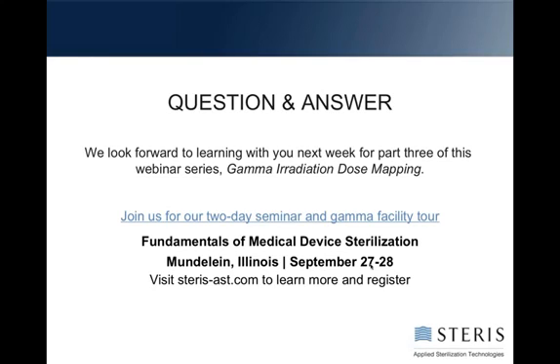All right, next question. What would be the best course of action if the quarterly bioburden for VD max 25 exceeds 1,000 CFUs? The question would be first, is it one sample or is it a whole bunch of samples? If I had outliers, I would look at the identity of what was in that bioburden to see if maybe it's something obvious, like maybe it was a handling issue, maybe there was a torn glove when somebody was working with it. Most people will take several different possibilities. First thing I would do is ID it.